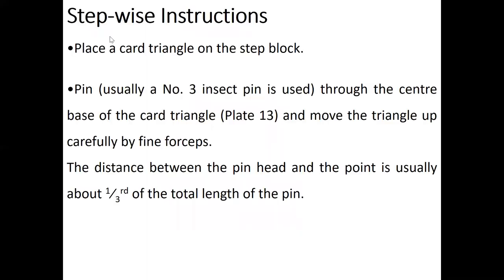So this is what you should do. From here onwards, I give you stepwise instructions. Place a card triangle on the step block. Pin through the center base of the card triangle and move the triangle up carefully with fine forceps.